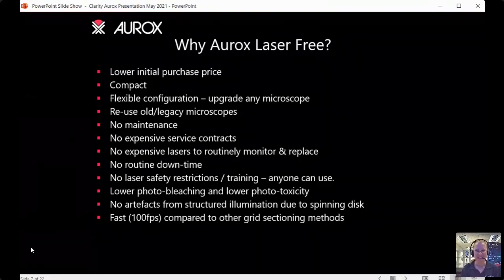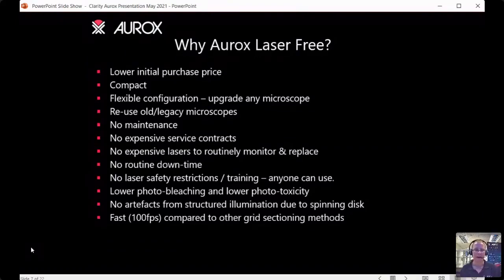You don't need to worry about laser safety or specialist training — anyone can use the system. LED light sources, in conjunction with the spinning disk technology, tend to be much gentler on your sample, giving lower photobleaching and lower phototoxicity. One important difference about our spinning disk is that because the grid is spinning, we don't get any artifacts compared with static structured illumination systems. It's also very fast, and performs very similarly to a laser-based spinning disk confocal microscope.